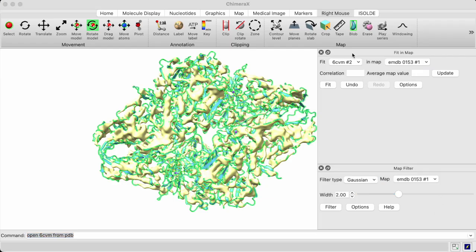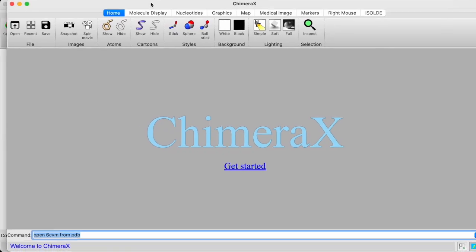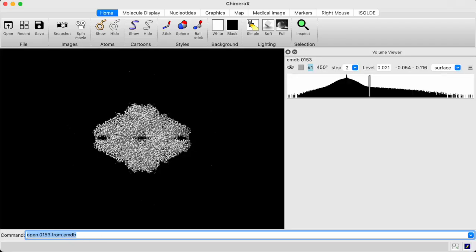Now what I just noticed is that in this version of ChimeraX 1.11, the tabs don't appear. So once I've docked something together, tabs should appear here, so I can switch back and forth between those. I'm not sure why that is, but for now I'm going to switch back to ChimeraX version 1.10. If you don't want to dock dialogs, you can keep using 1.11, but let's see what happens in ChimeraX 1.10. So I'm going to open the map again. Open the model.